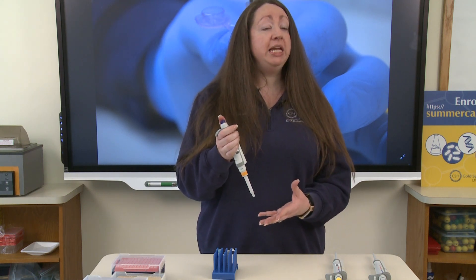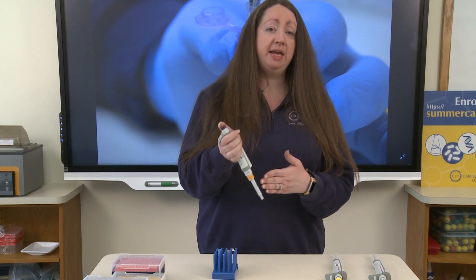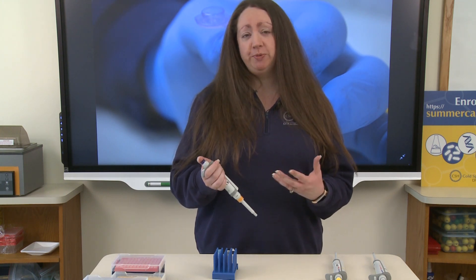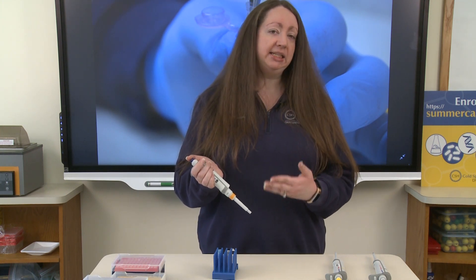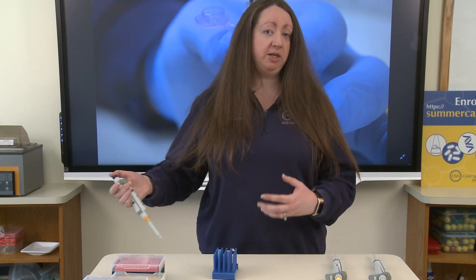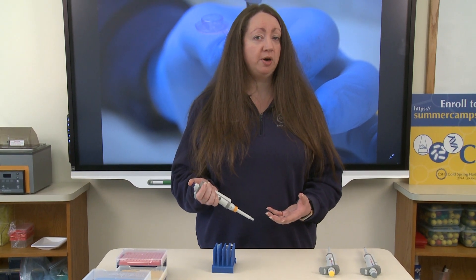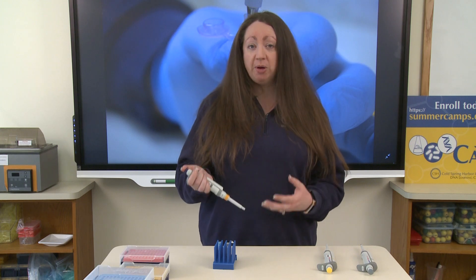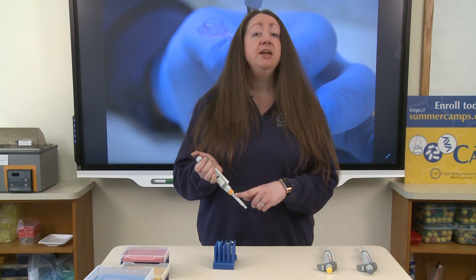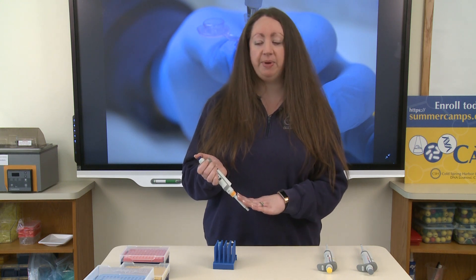Can we pipette from one solution and then directly into another and another? No — that's a bad idea, because any liquid this pipette comes into contact with will then mix with every other liquid after. We call that cross-contamination. To avoid cross-contamination, we place a disposable pipette tip onto the end of our pipette, ensuring there is no mixing of liquids and chemicals inside the pipette.